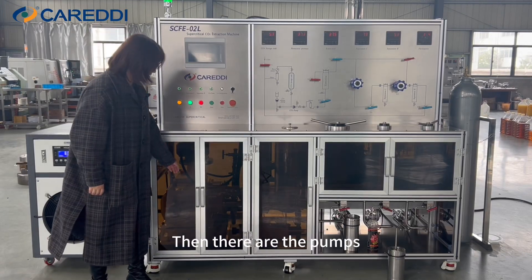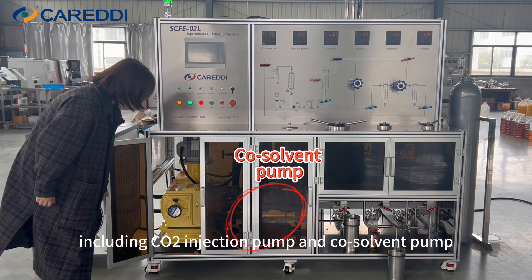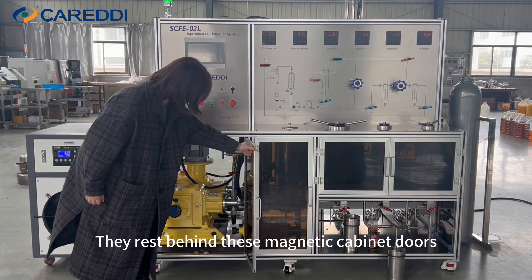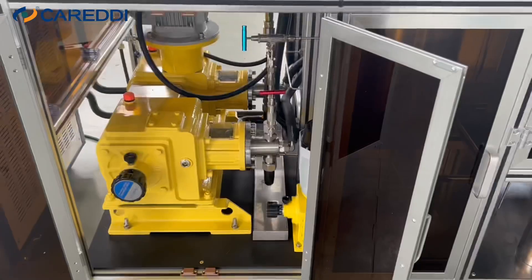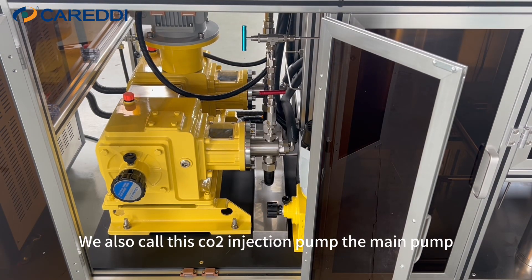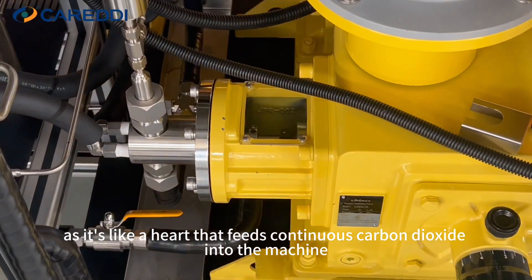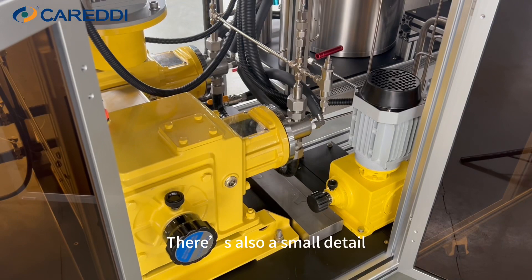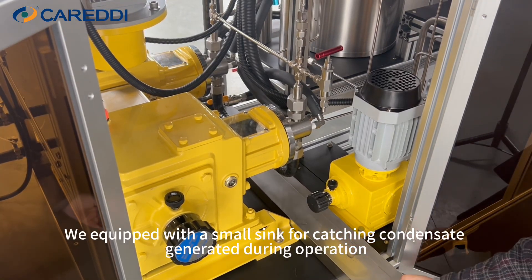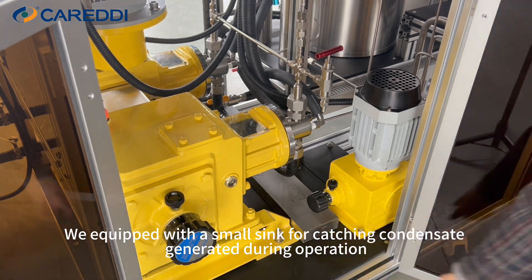Then there are the pumps, including the CO2 injection pump and co-solvent pump. They rest behind these magnetic cabinet doors. We also call this pump the main pump, as it's like a heart that feeds continuous carbon dioxide into the machine. There's also a small detail — we equipped it with a small sink for catching condensate generated during operation.